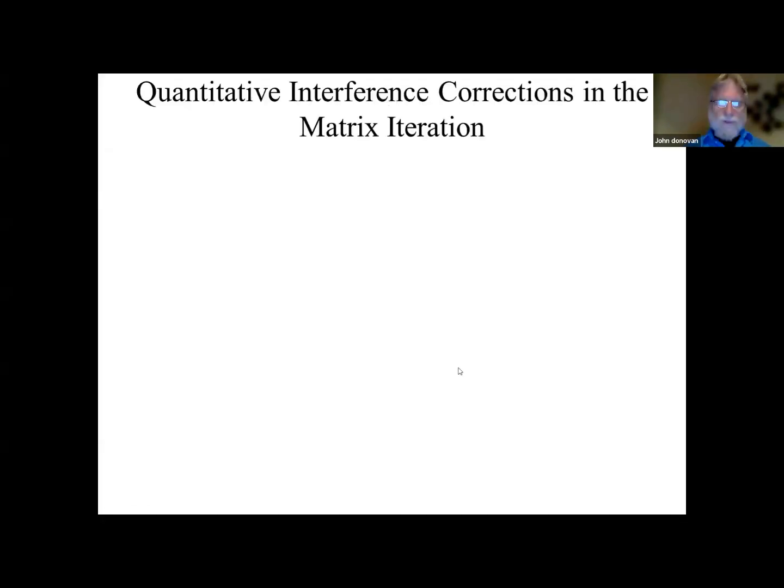So now let's talk about interference corrections. This was all developed back in the 70s. Gilfrich proposed a method for correcting of interference corrections by doing a ratio of a standard between the unknown and the interference standard, which is this S bar here. And that's, of course, relative to the actual primary standard. And it worked okay. The problem is that if your unknown was quite different than your interference standard, and by definition, they have to be different because the interfered element cannot be present in the interference standard.